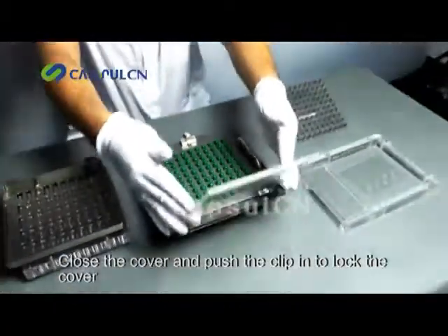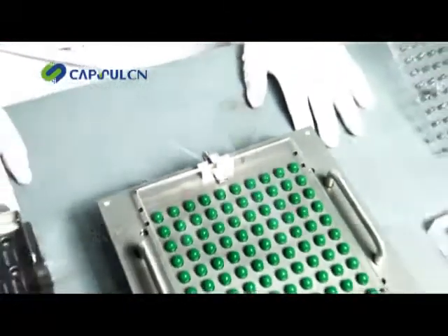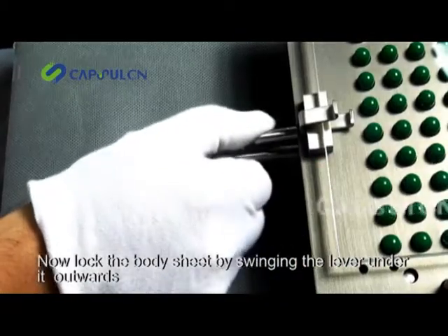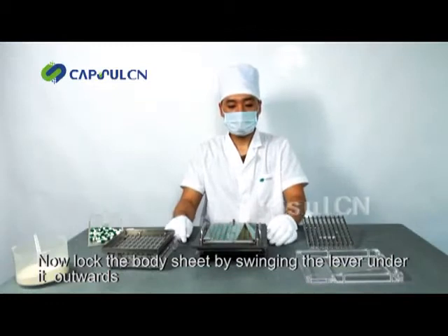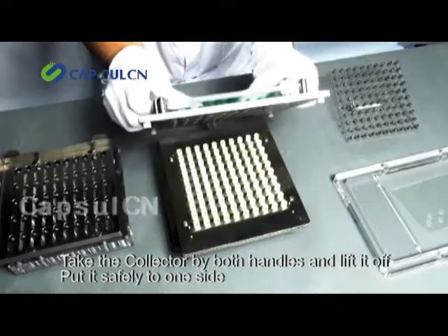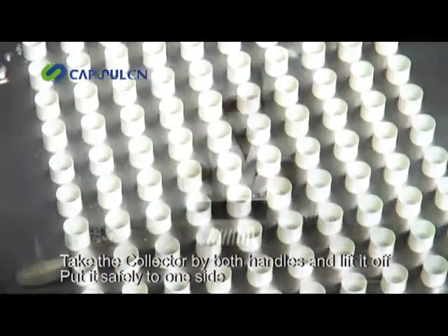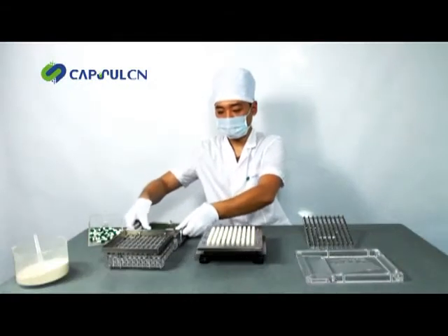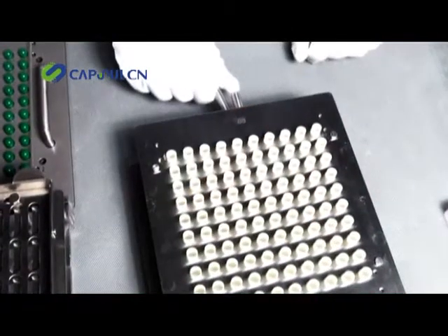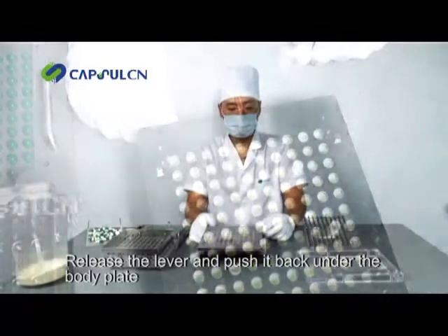Close the cover and push the clip in to lock the cover. Now lock the body sheet by swinging the lever under it outwards. Take the collector by both handles and lift it off. Put it safely to one side. Release the lever and push it back under the body plate.